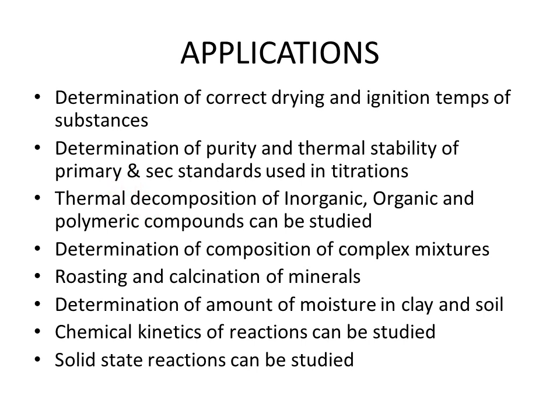We can find the thermal decomposition of various inorganic, organic, and polymeric compounds. We can determine the composition of complex mixtures. Then we can study the roasting and calcination of minerals, in which minerals get thermal treatment in the absence or presence of a limited supply of oxygen, and they are decomposed.